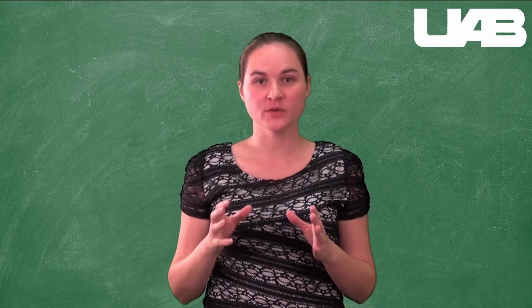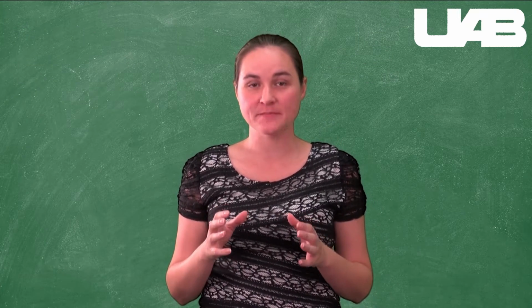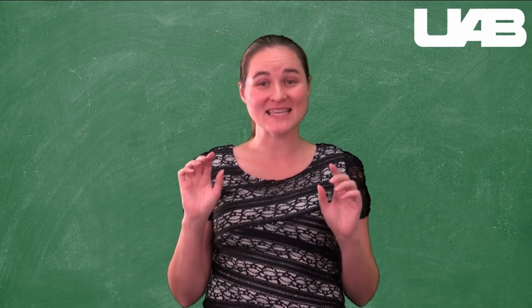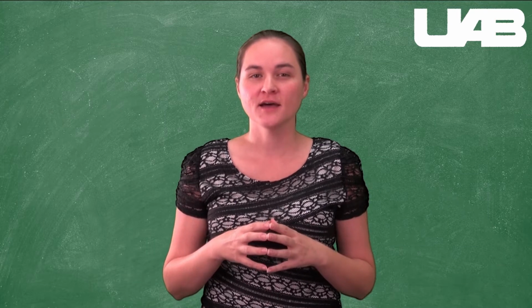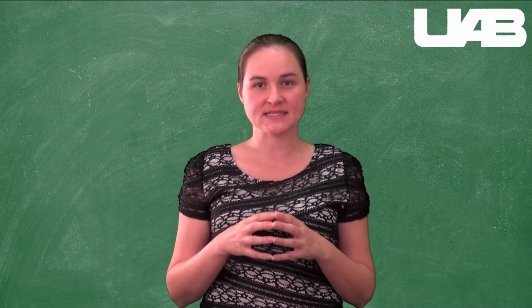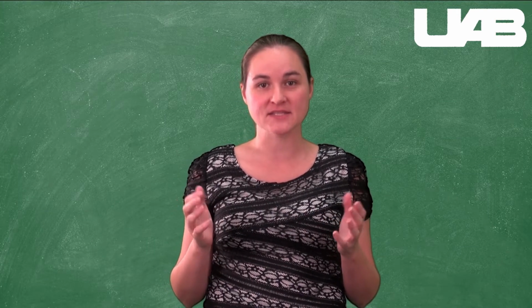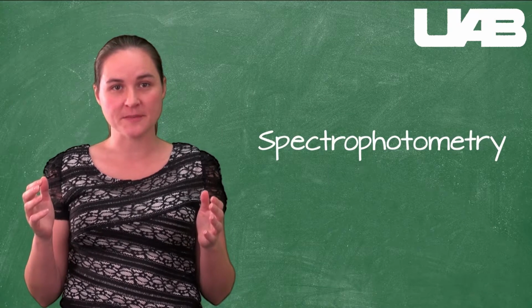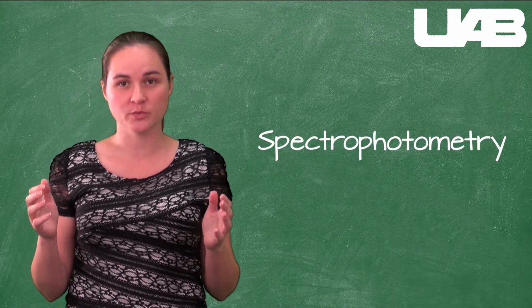In this laboratory, we will be preparing a complex ion by adding ammonia to a copper solution. The resulting compound is an intense blue color. Lots of transition metal complexes can produce interesting colored compounds, and chemists tend to think that they are cool, so you should too. Additionally, we will be using spectrophotometry to analyze the solutions that you will prepare.